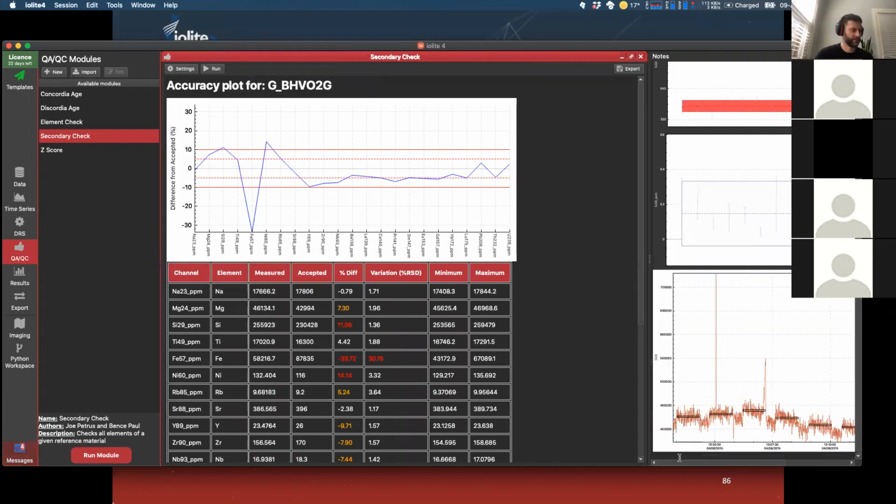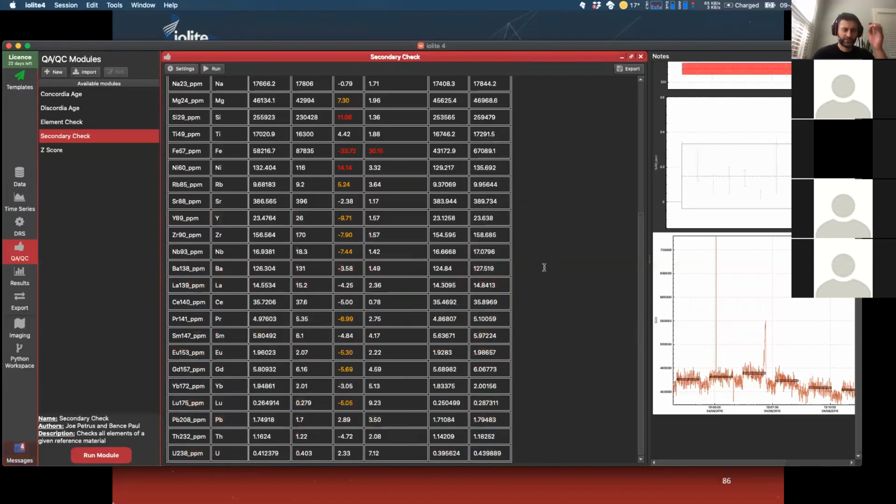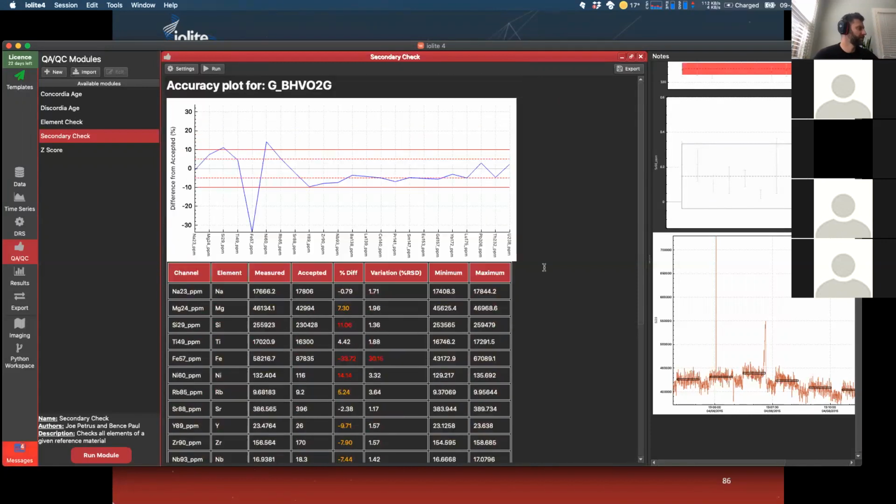So if I was to, say, hold down the Alt key. Oh, actually, no, sorry. That one you can't drag into the notes, but is that right? I assume you're talking to me. Yeah.